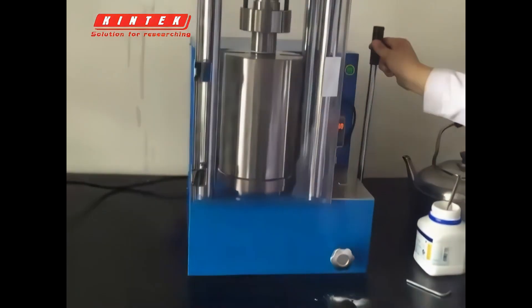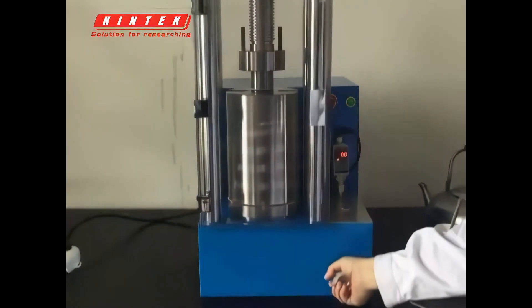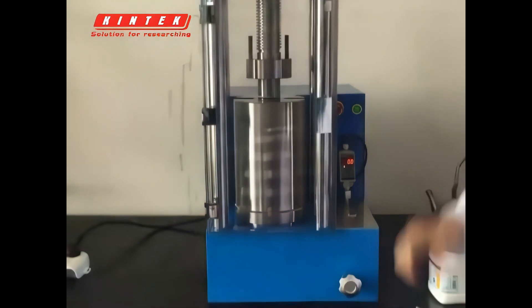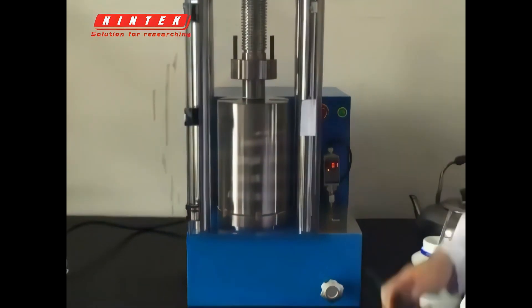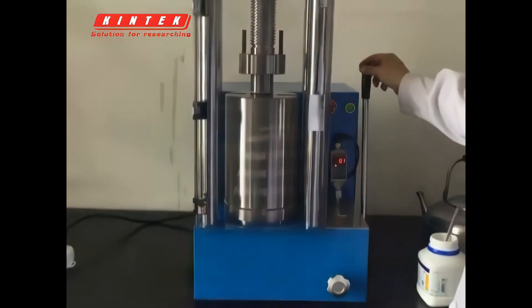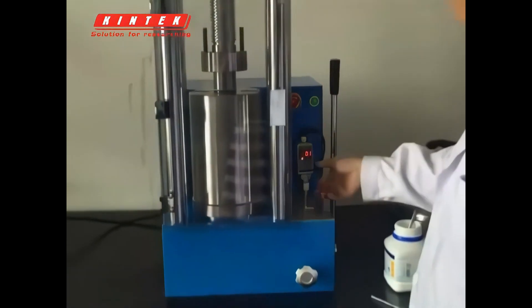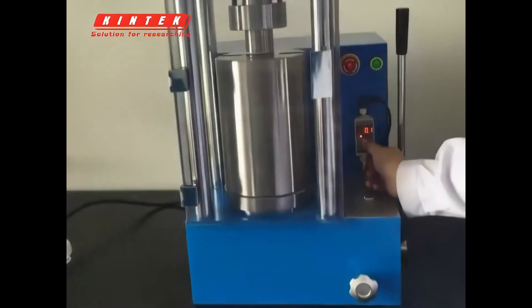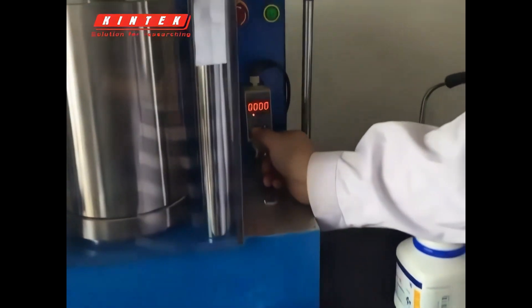We start pressurizing. There are manual mode and electric mode. Tighten the anti-oxidation plug first. This is manual pressurization — we can see the pressure gauge is changing. This pressure can be precisely controlled.